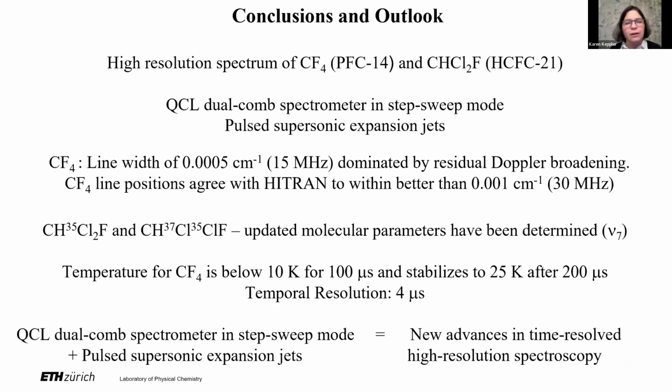And as we've looked at CF4, it was quite interesting that we could find the temperature was pretty low to start and came up a bit to about 25. We had a temporal resolution as we looked at the time traces of about 4 microseconds. So what we've done in the end is we've taken a very new tool together with these older measurement methods, and we've combined it to really contribute to some advances in very high resolution spectroscopy and time resolved spectra as well.